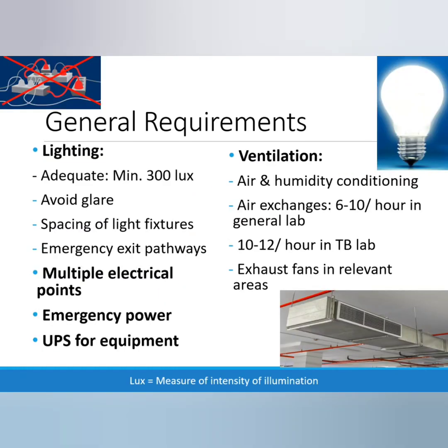Lighting. A laboratory must have a minimum lighting of 300 lux, where lux is a measure of intensity of illumination. The lights should not produce a glare on the workbench. There must be appropriate spacing between the light fixtures, and the emergency exit pathways must also be lit adequately.